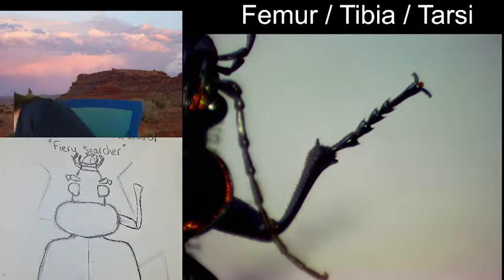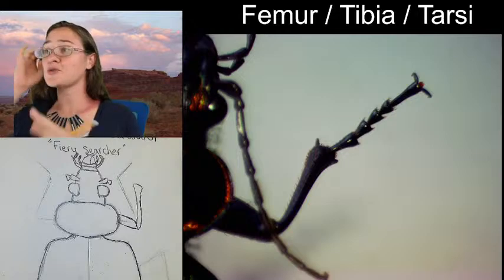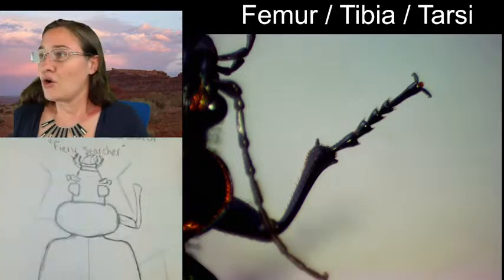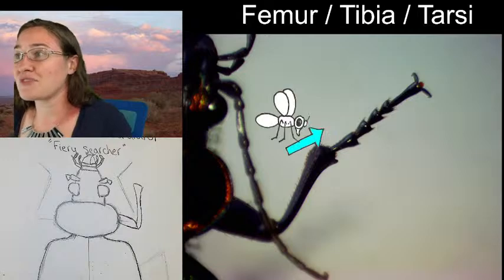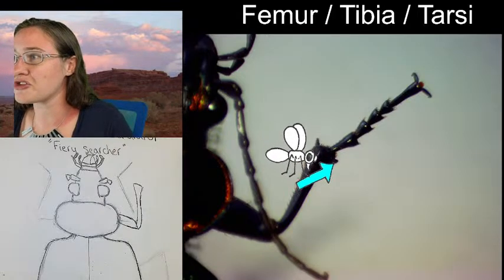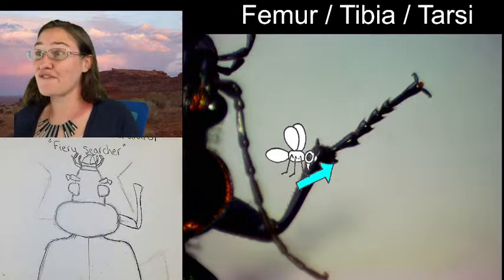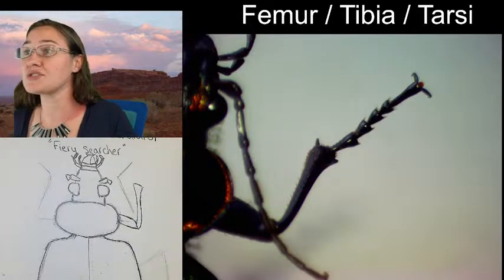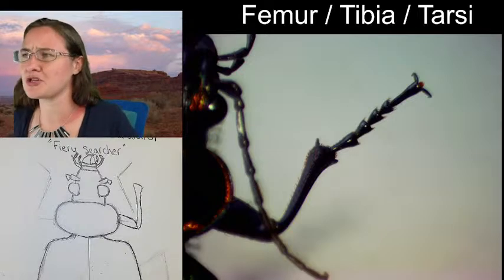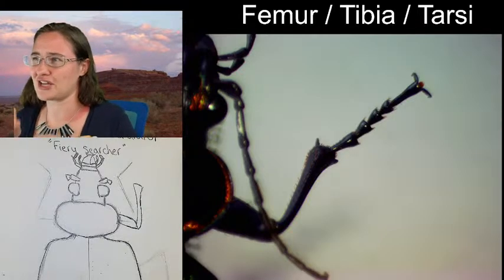I do believe, yes. Our tibia has two tibial spurs. They're both on the inside. So when we are looking at it from this angle, it's this little spike right there. And you can see there's almost a little spike over there. Those are actually fairly long tibial spurs. Those are long tibial spurs. Just from this angle, they look short.